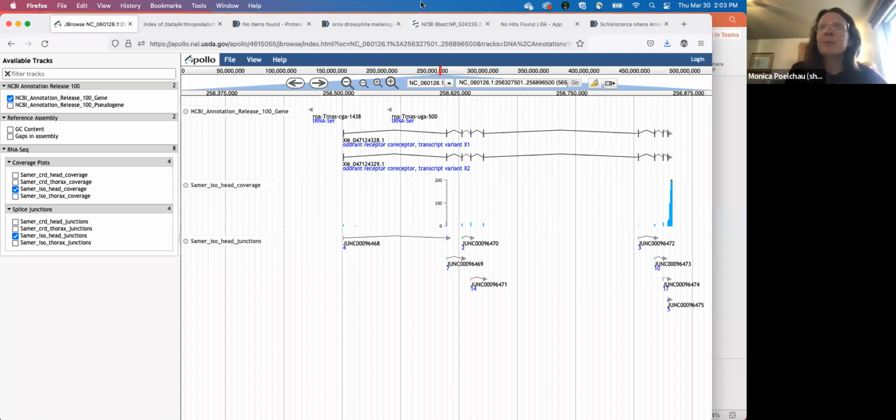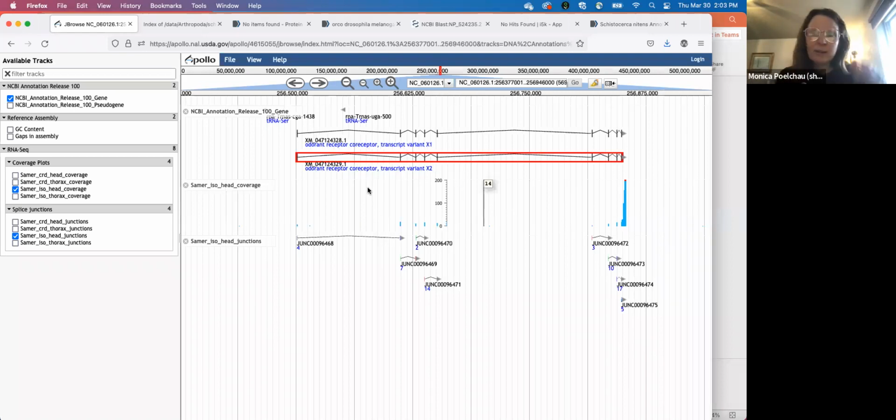You can say, okay, we're checking the gene structures here. We did a multiple sequence alignment. There's a start codon, a stop codon. Most of the sequence seems complete. And if there's a little bit of inconsistency here, like this track has two aligned reads, what does that mean? You might not want to go into that level of correction, right? Because is it going to be worth your time to change the model and go into that level of deep detail? Maybe it is, but maybe it's not.